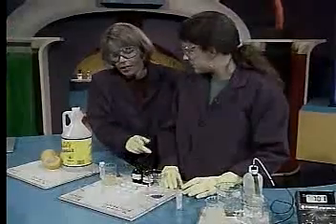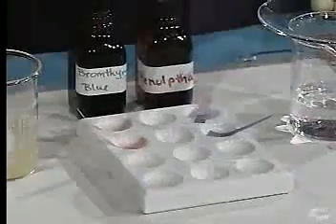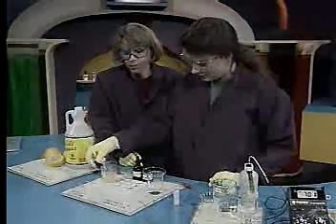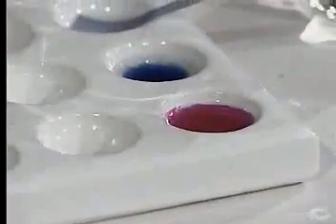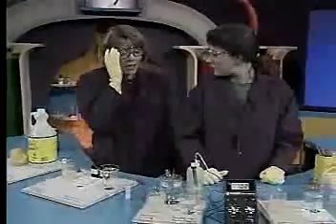Good. All right, the next test we'll use for an indicator is bromthymol blue. Okay, I'll put a drop of bromthymol blue into the ammonia, and it's blue. And in the lemon juice, it's yellow. Okay, next indicator, phenolphthalein. Phenolphthalein is colorless in lemon juice and pink in ammonia. All right, so we're done with these tests. Let's move on to the next set of diagnostic tests, taking the pH.